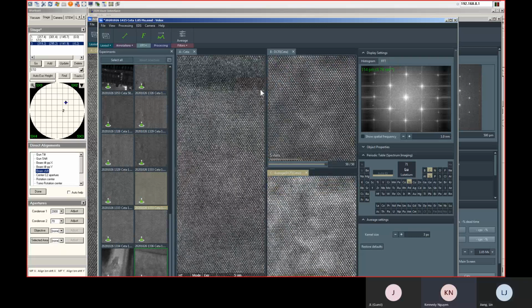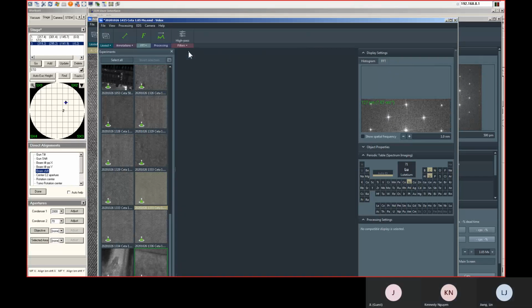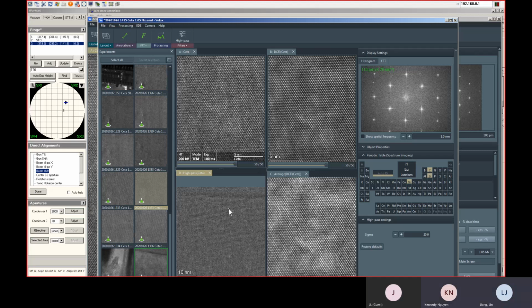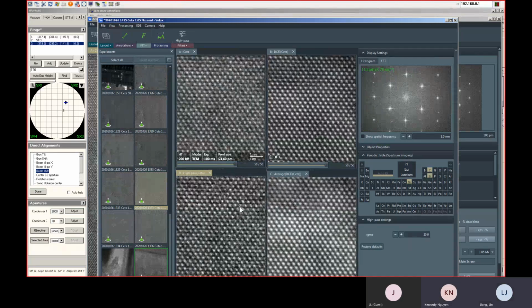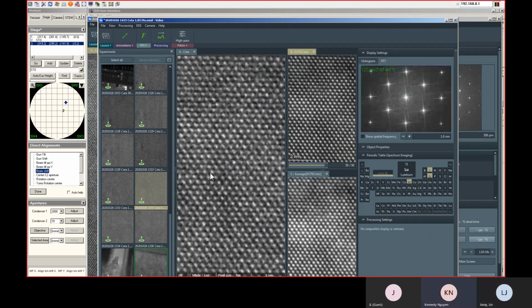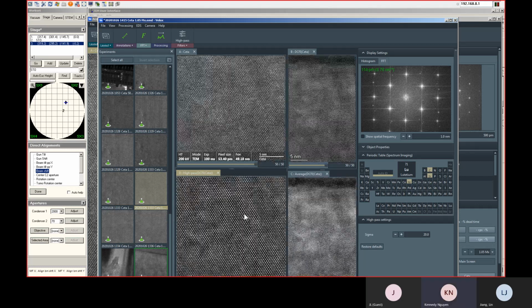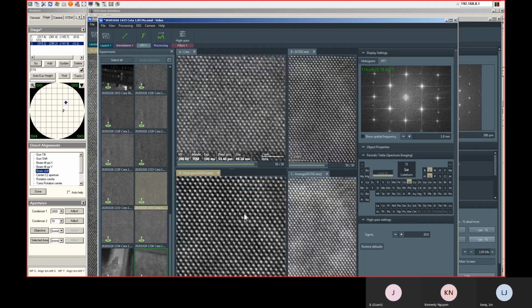Yeah. Okay. Try high pass. Okay. You try high pass on DCFI, not on the single frame. Oh, okay. So this is, oh yeah. Should do it on the, select DCFI. Okay, yeah, so this one. Then high pass filter. Now one looks much better. Yeah, right?